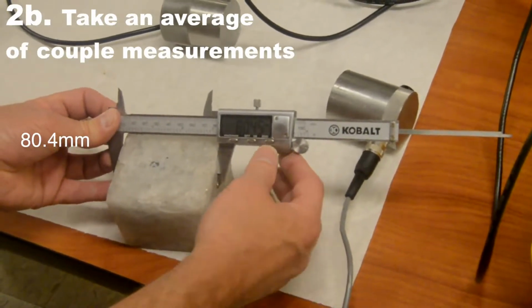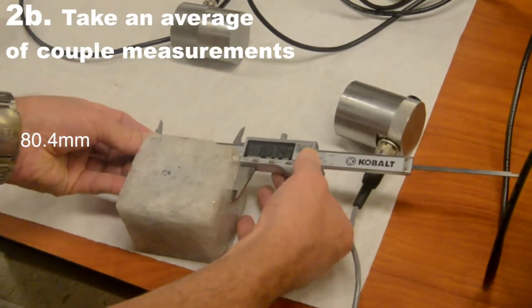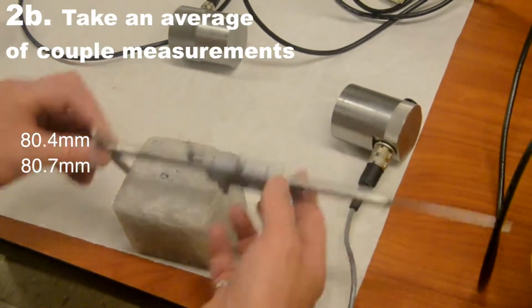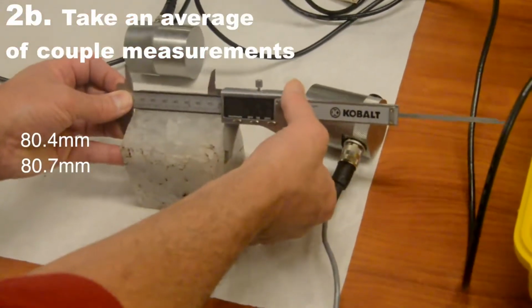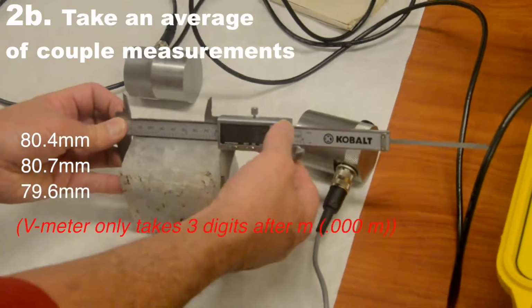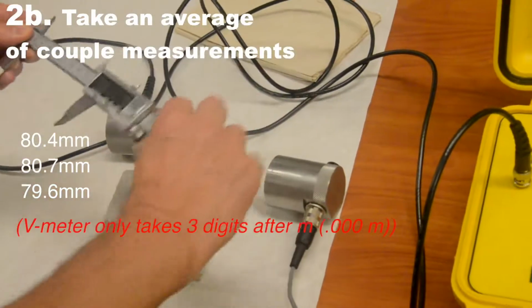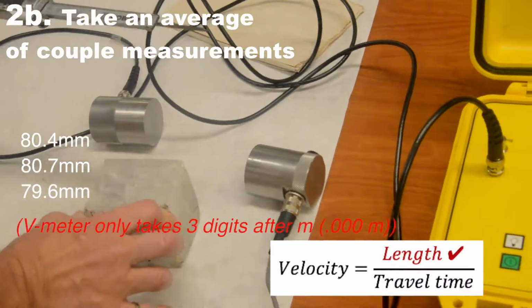Now we want to make that measurement a few times to make sure that we're in good shape. So here we've got 80.7. This time we've got 79.6. So on average, this is about 80 millimeters thick. And we'll keep track of all those measurements. So now we know the thickness of the sample.